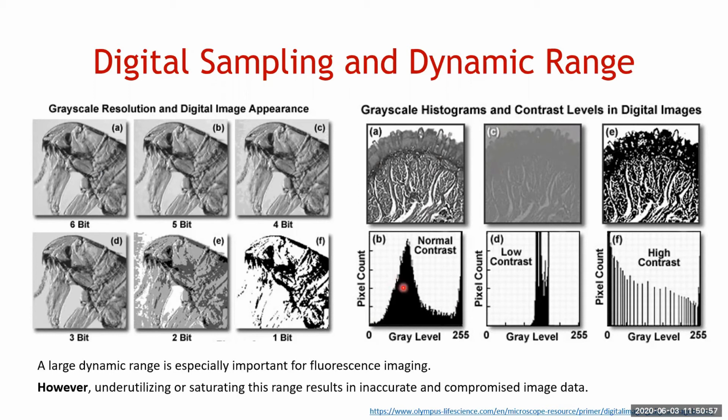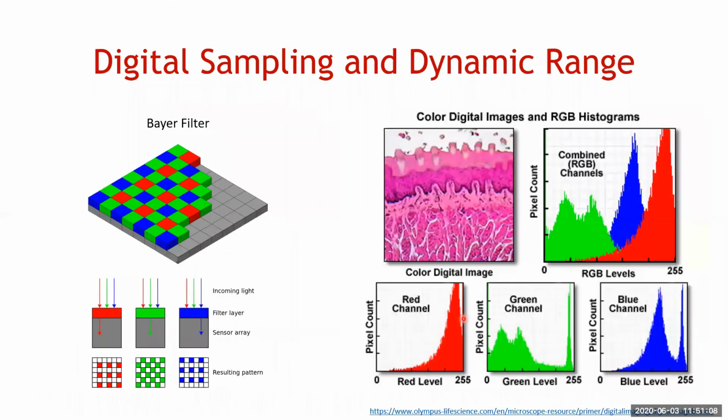So that's the one thing you have to think about every time you sit down on a microscope. Make sure you use the dynamic ranges given to you. Don't saturate. So that's kind of the tip that we want to give you.